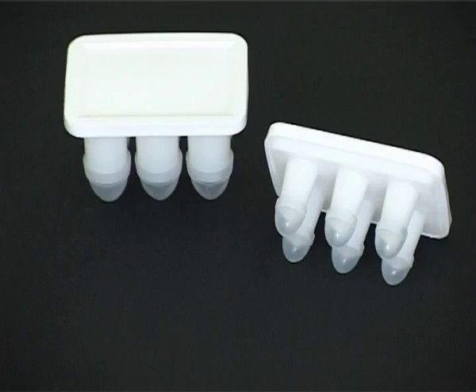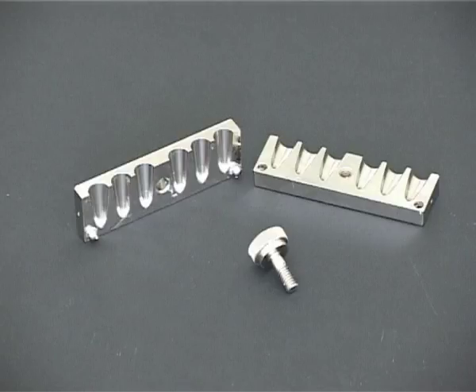For convenience, plastic disposable moulds are often used in hospitals. This traditional suppository mould consists of three parts, two sides held together by a screw.